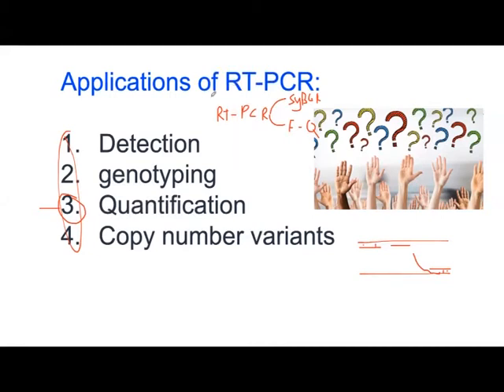All right, so now, can we sequence RT-PCR products? Yes. After you do the RT-PCR method, you get a PCR product, and there are ways to sequence those. If you are worried about the fluorescence intensity, that's not an issue, because if you're using SYBR Green, you can purify that product and run it for a sequencing reaction. So you don't have an issue.